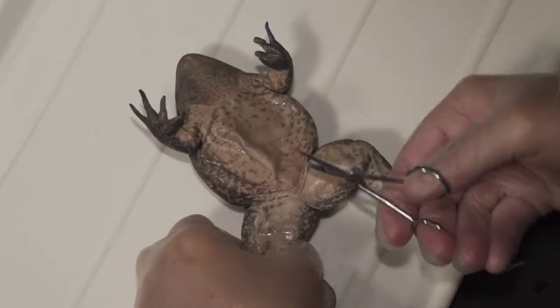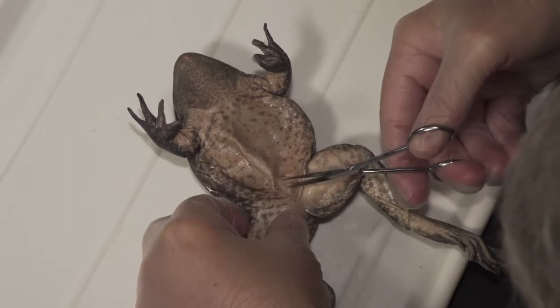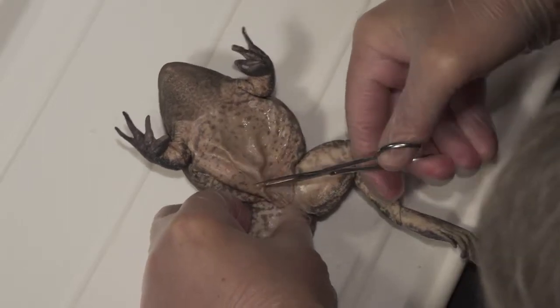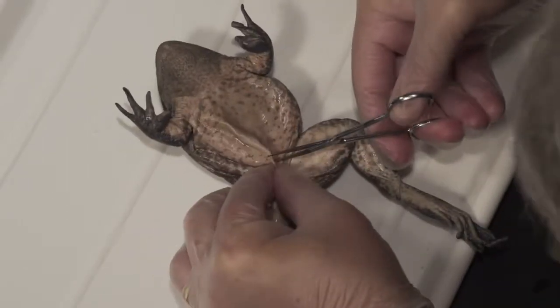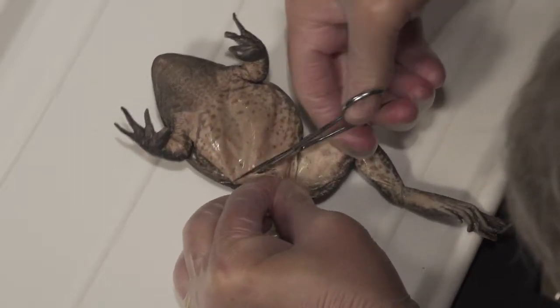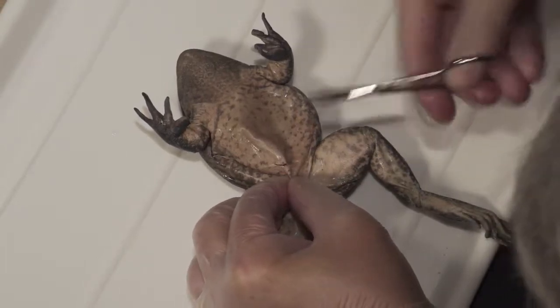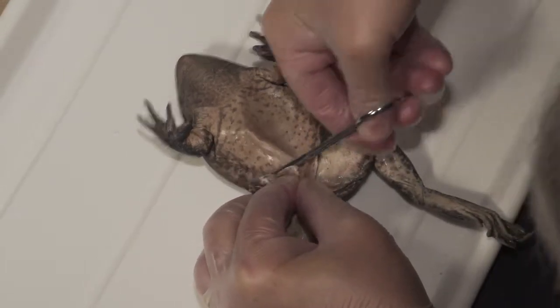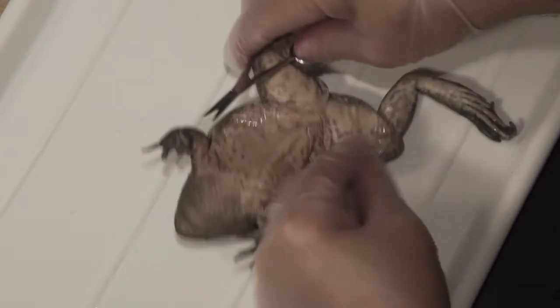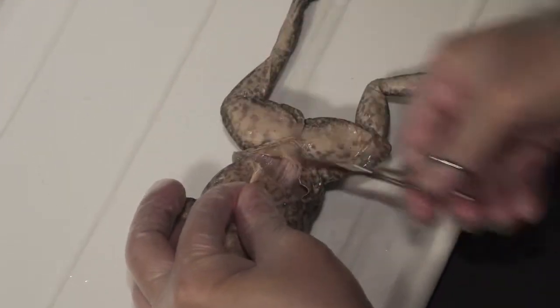The first cut we want to make is to open up the body cavity, and the first thing to do is get the skin off. So you want to take a scissors or a scalpel and go down into there — you'll see the skin is loose there. And so you want to cut across this way.